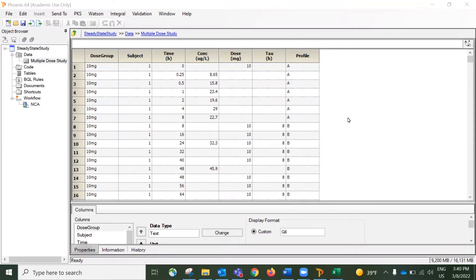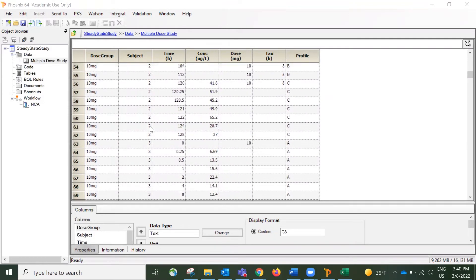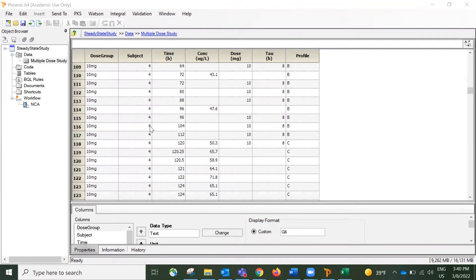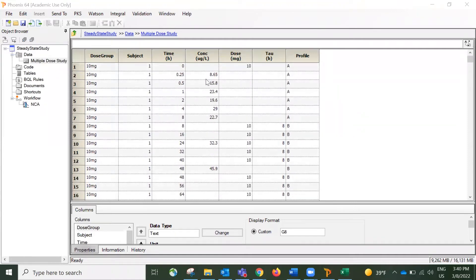I now have a project open in Phoenix. Let's take a look at the dataset first. This is a time concentration dataset that contains multiple subjects with multiple dosing groups, and each subject also received multiple dosings as well.